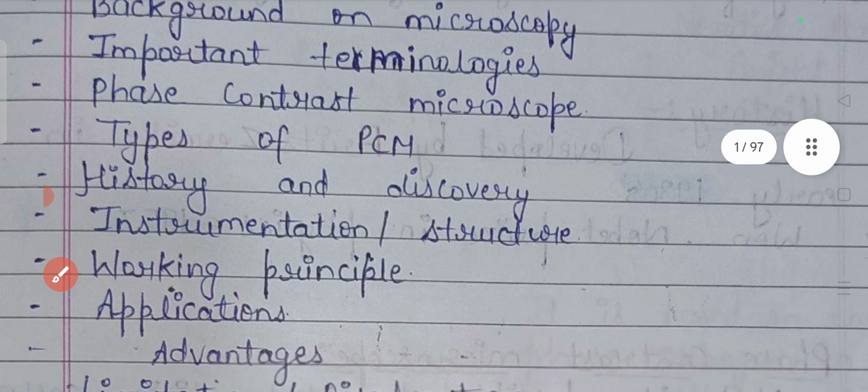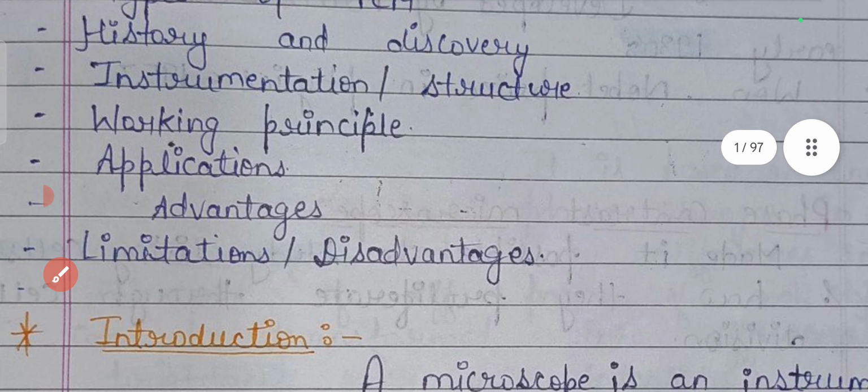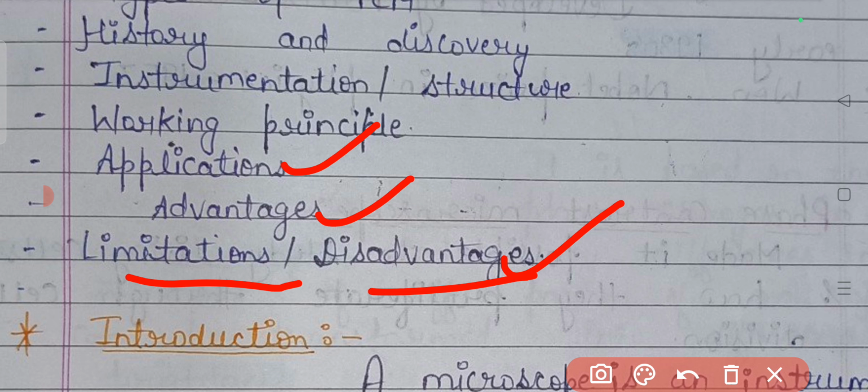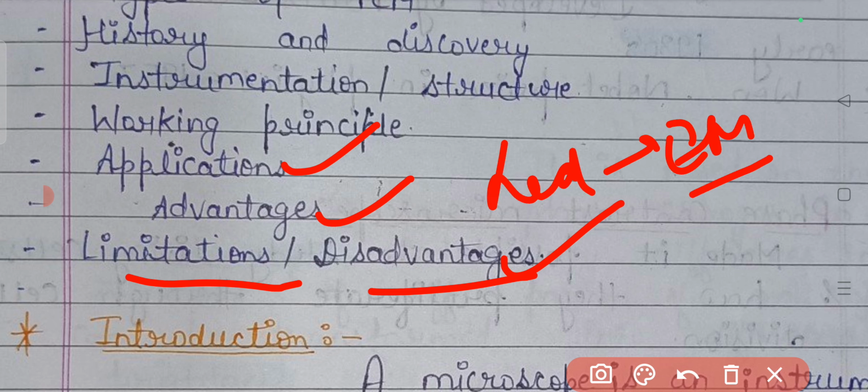the basic principle on which the entire processing of the phase contrast microscope depends, the working principle, again the applications part, because the applications of each microscope are very important, the distinguishing features between one microscope and another, the advantages it has, and the limitations and disadvantages, which again led to the development of a new microscope, that is the electron microscope.